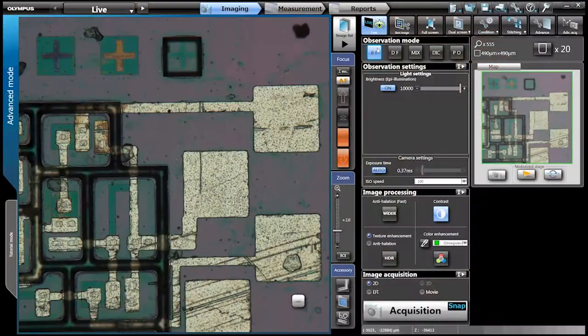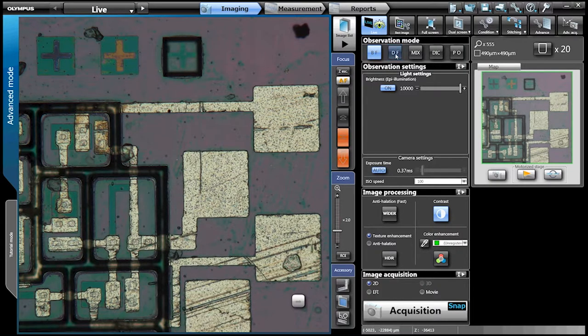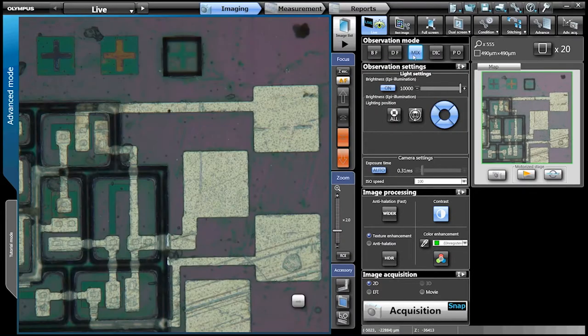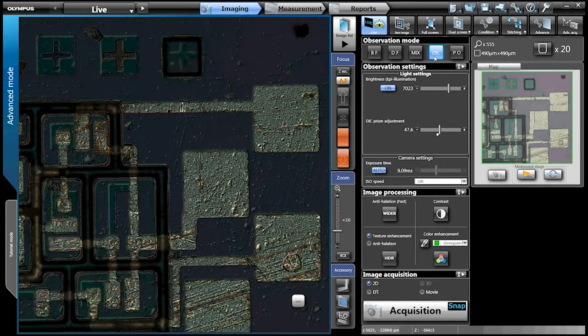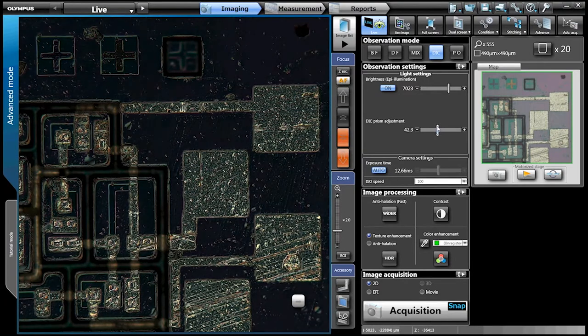With a touch, choose bright field, dark field, or you can even mix bright field and dark field to visualize surface defects more clearly. Differential interference contrast and polarized light are also included.